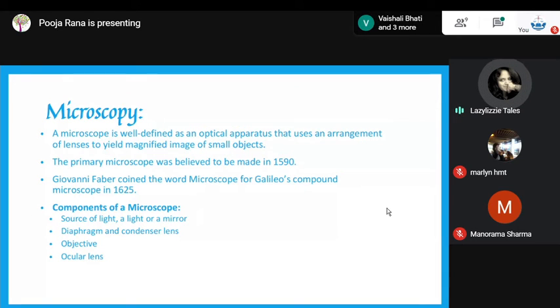Microphotography is like very close-up images using very high-density lenses. Like you said, something that is not visible to the naked eye, but it needs to be seen in a higher resolution with regards to, if we take it into consideration, the evidence factor. And if that is one element that is crucial and needs to be seen in high resolution, then microphotography comes into the picture. Okay. What would you say about photomicrography? I'm not very sure about it, to be honest.